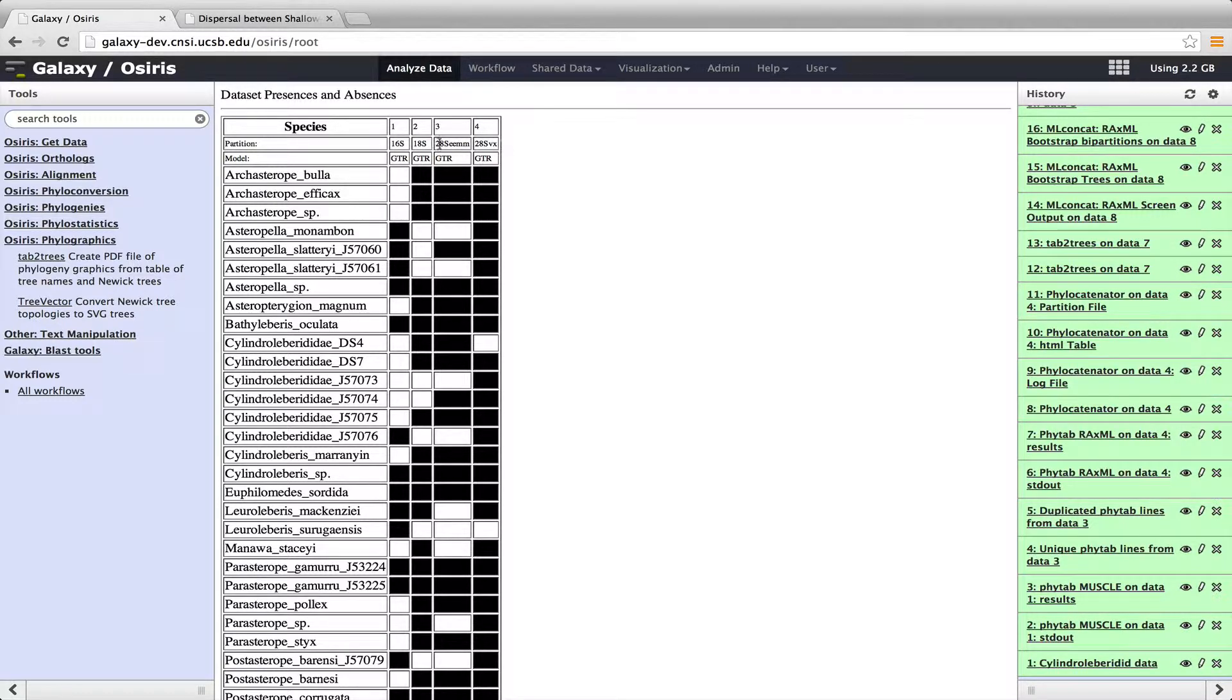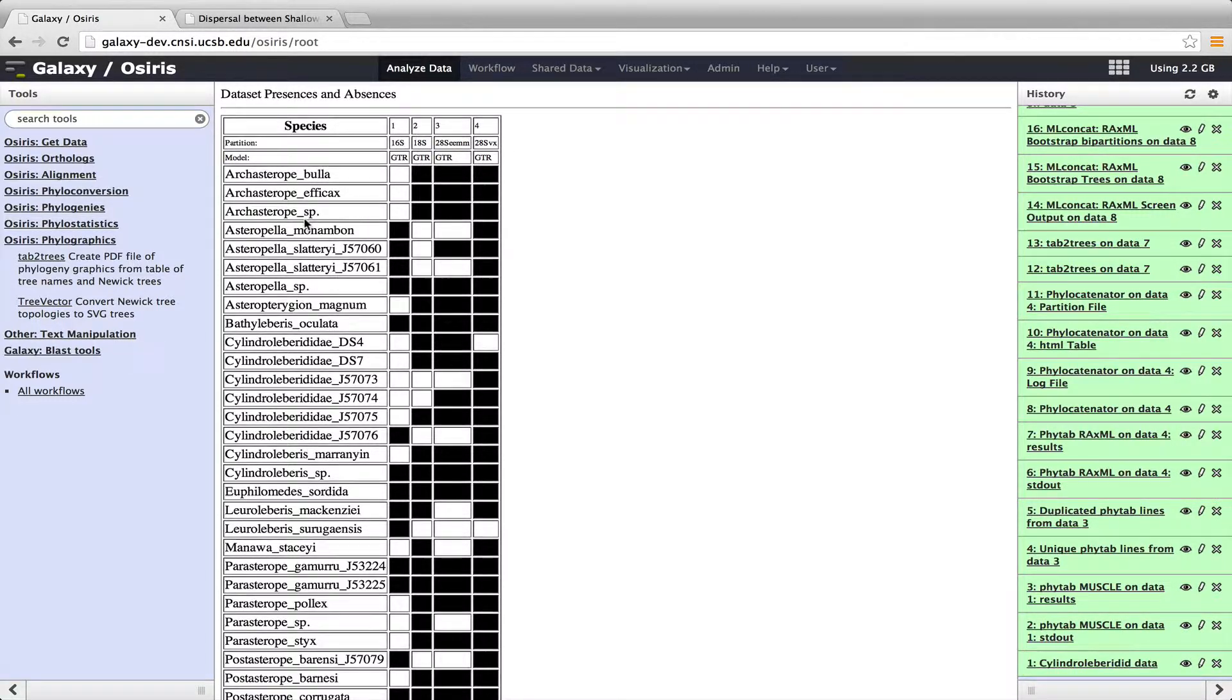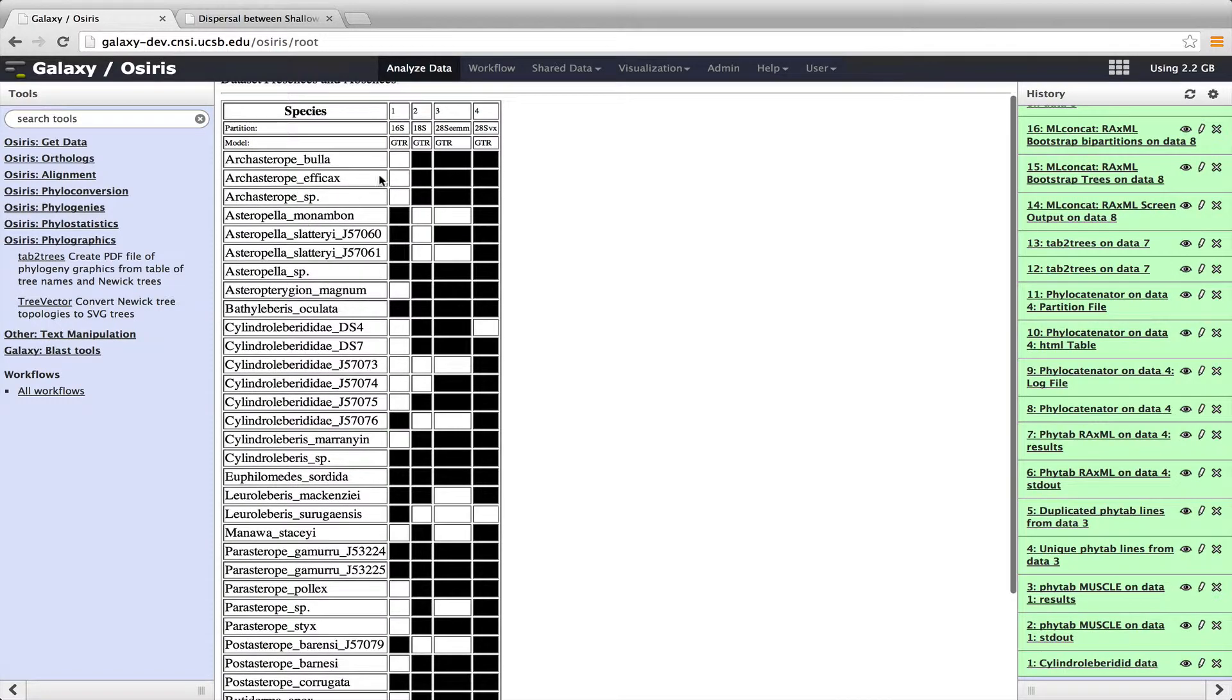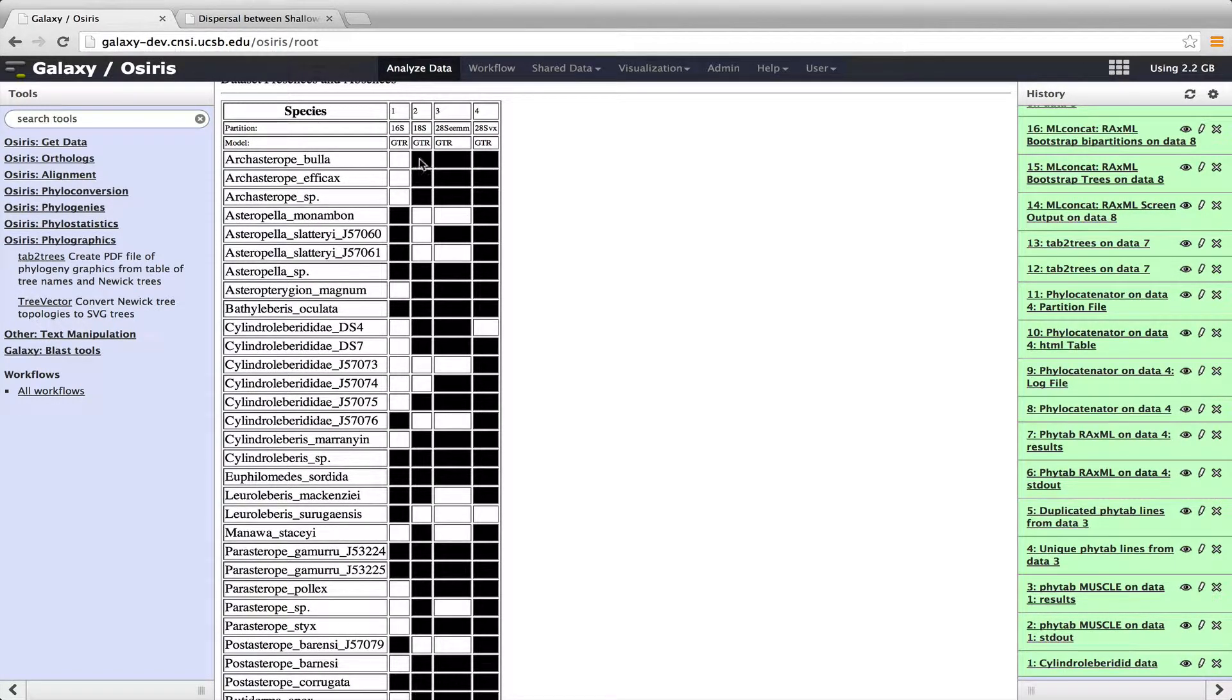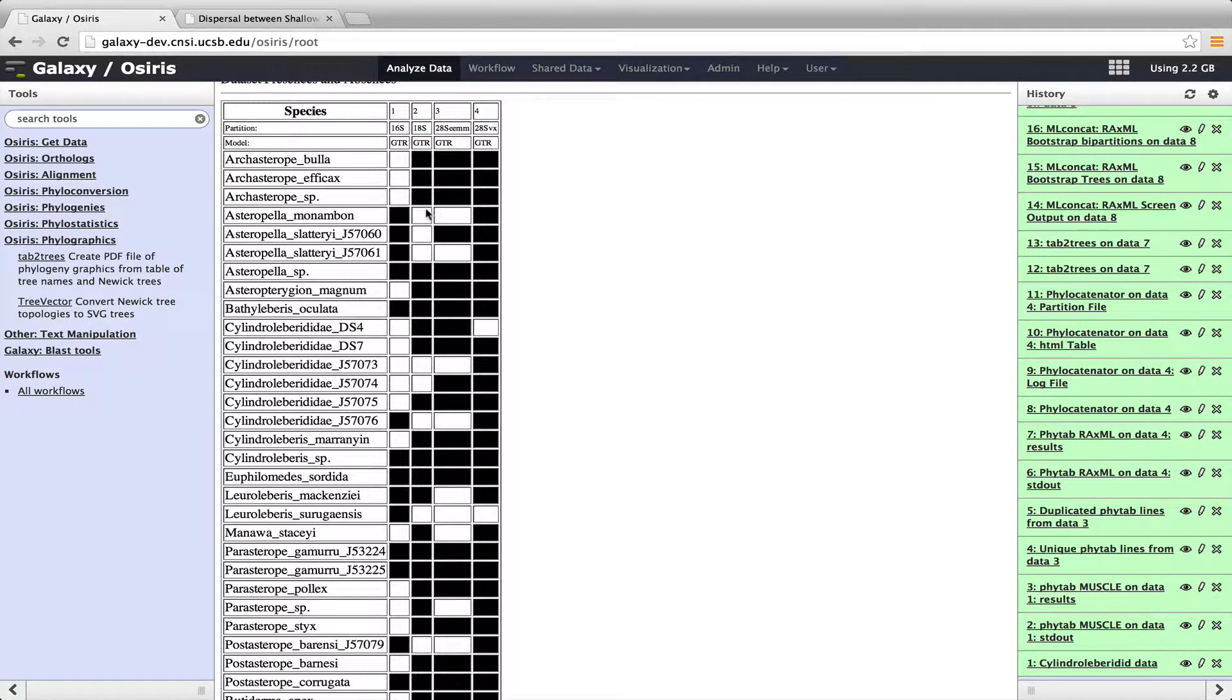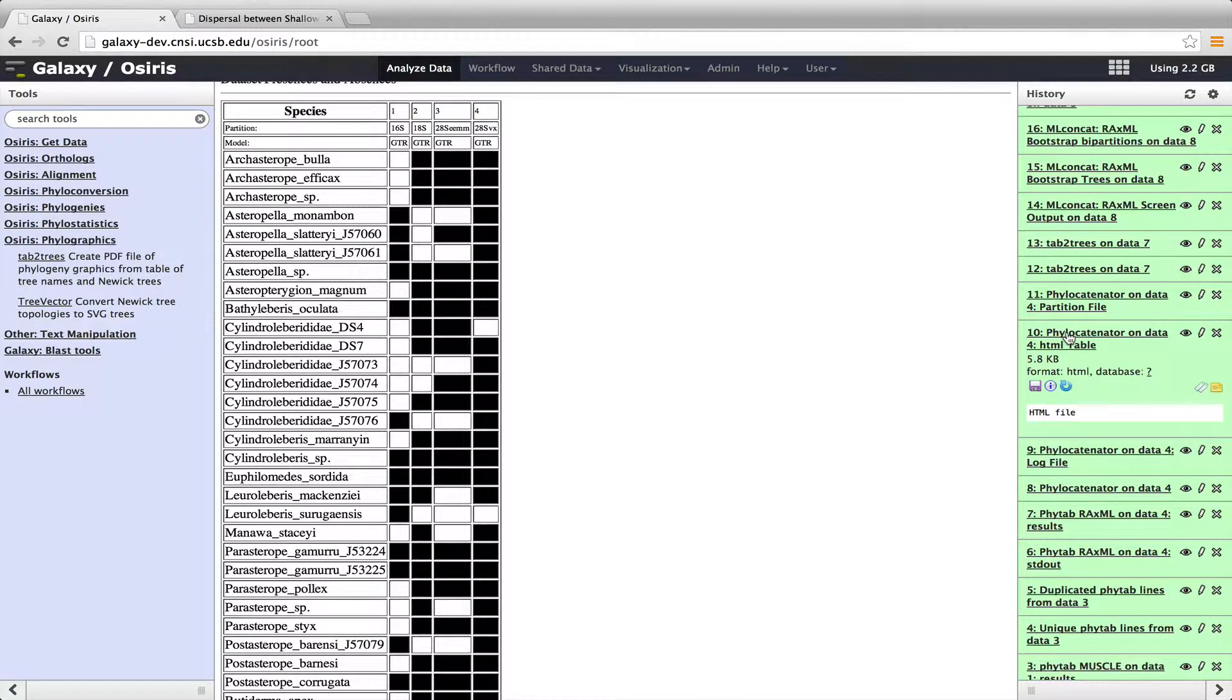So these columns are genes. And we have 16S, 18S, two 28S regions. And the columns are different species. Those that are shaded in black are cases where we have that combination of species and gene. And those that are shown in white are where we don't have those data.